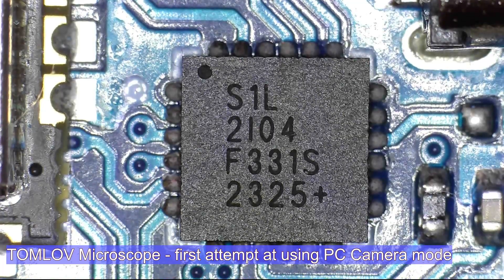You could also feed the output from the microscope to an external big monitor, but it's just as easy to pipe it straight into the PC for the purposes of making this short video, which is just to accompany the blog entry at techscargle.net. Hope that was useful.